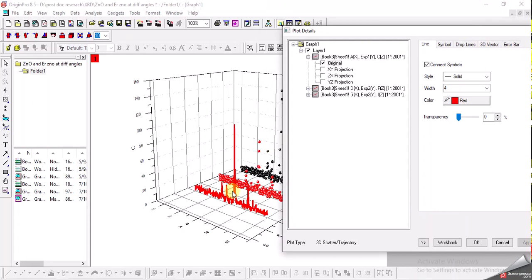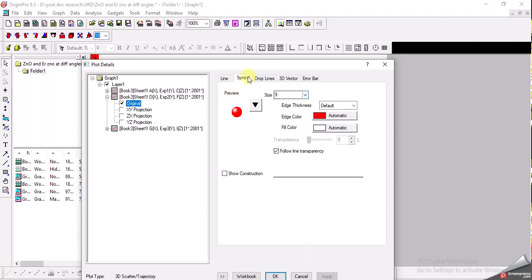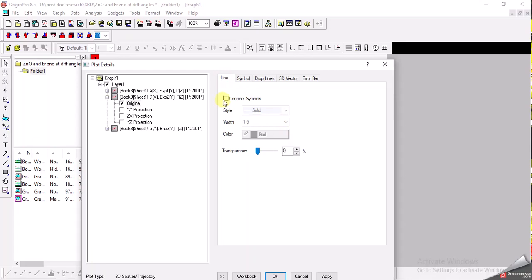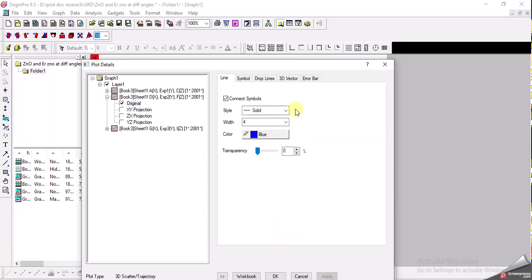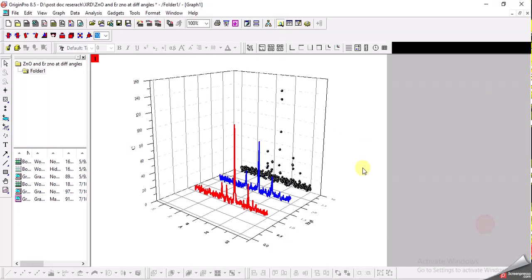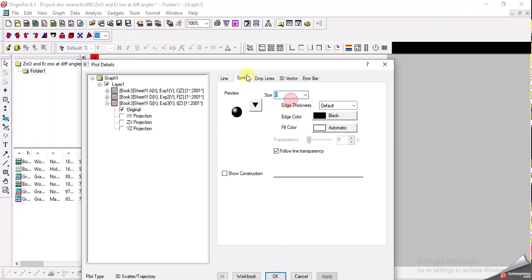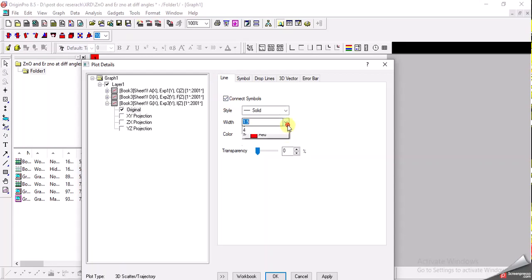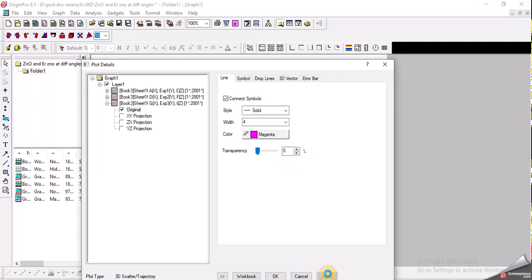Now it's changed to line format. I also want to change the other two graphs. I click on Plot Details for the second one, make the symbol size 0, increase the line thickness, and change the color to blue. Apply. For the third line, the black one, I go to Plot Details, make the symbol 0, change the thickness to 4, and set the color to magenta. Apply.